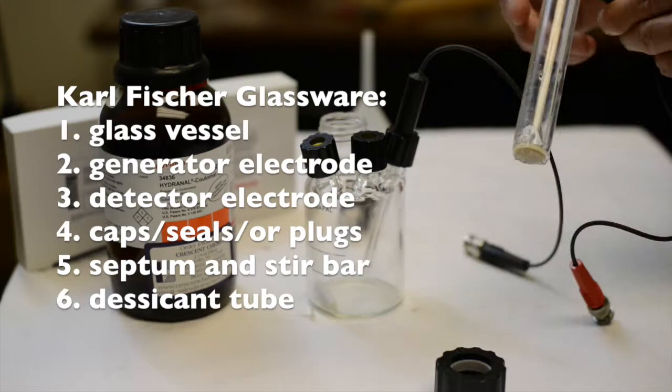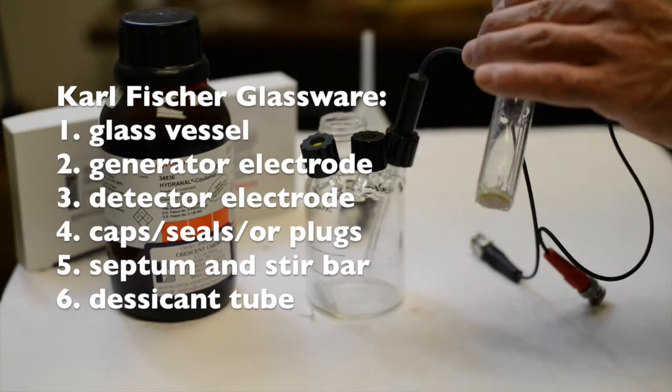Caps, seals, and plugs are used to prevent any outside moisture from entering the vessel. Septums are used to allow the operator to inject a sample using a syringe and needle.